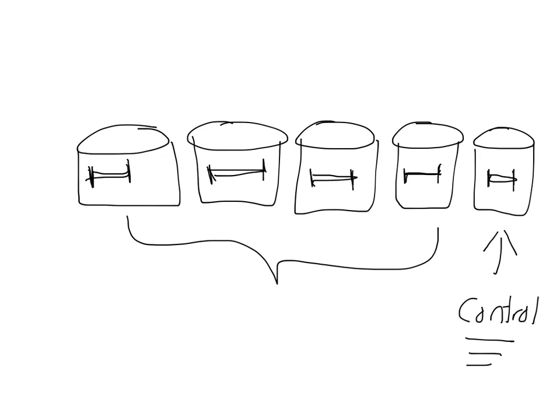And then once you're all done, after you weigh them, you're going to take out your dialysis tubing, place it into another little beaker, and you're going to test the inside amount for your unknown, or you're going to test the outside, depending on what was in the bag and what was on the outside. So again, this is all up to you guys. If you have any questions, let me know.